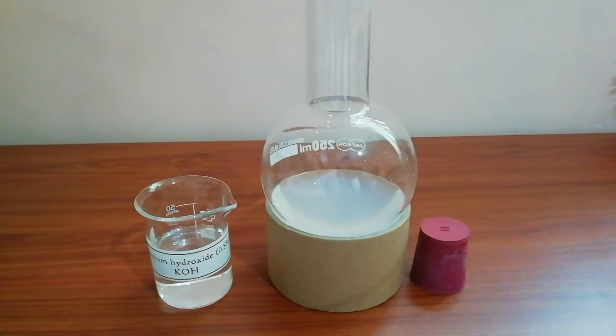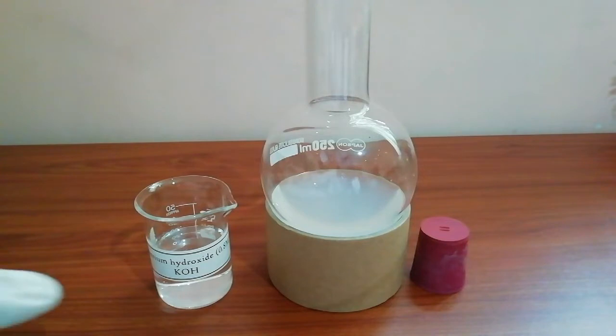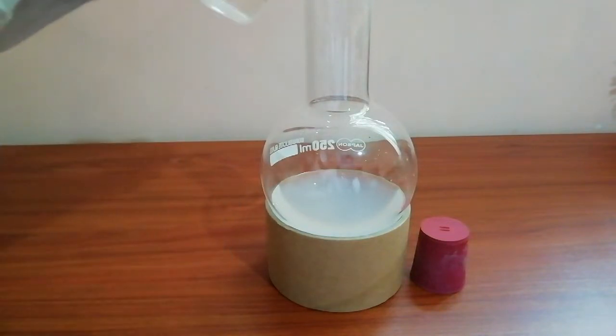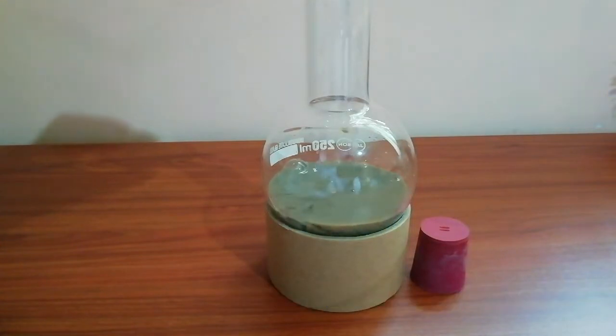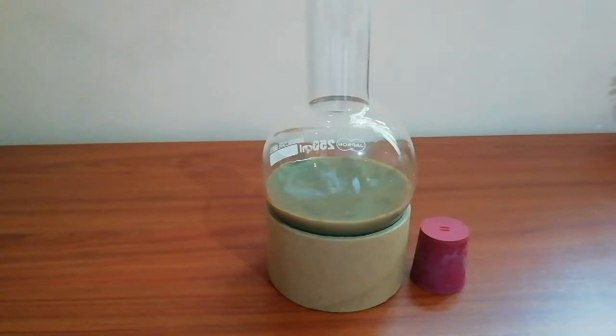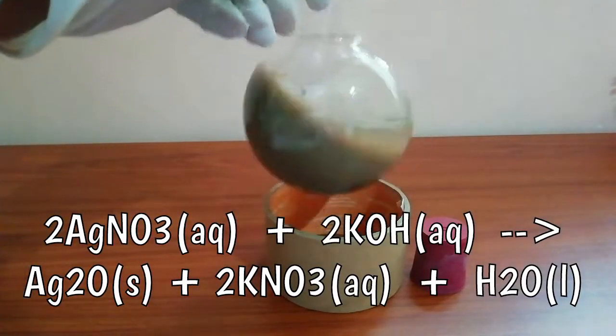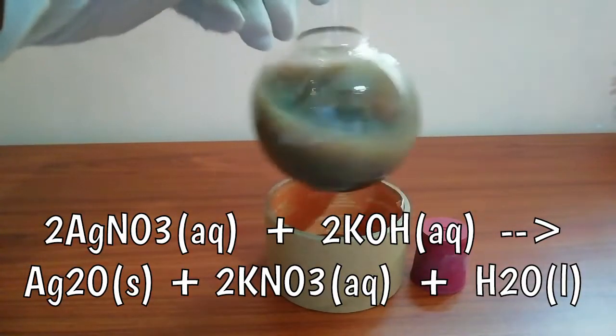Then I add 35 milliliters of potassium hydroxide. Potassium hydroxide reacts with silver nitrate and forms silver oxide.